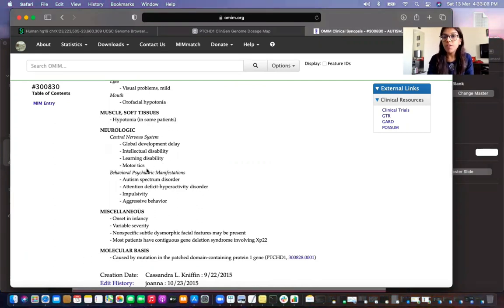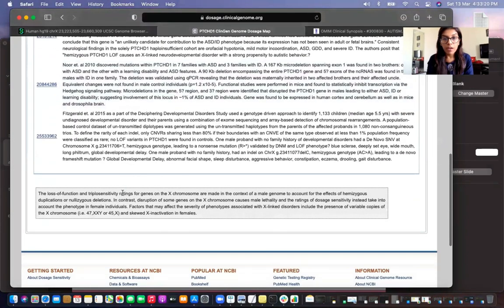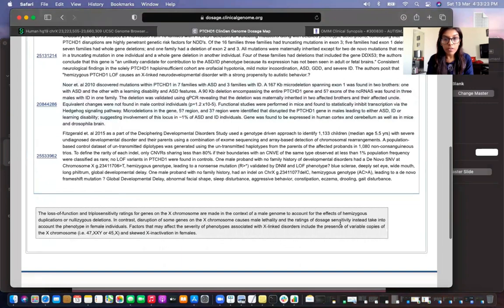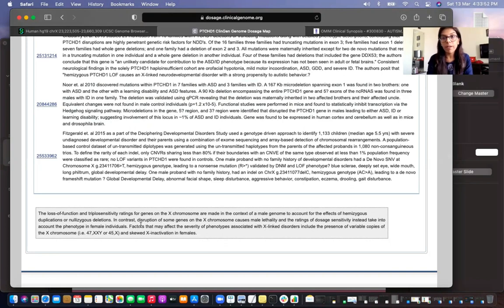The referral example we are studying consists of much more clinical phenotype than just the neurological phenotypes. An important note on the ClinGen dosage sensitivity page is that loss of function and triplosensitivity ratings for genes on the X chromosome are made in context of a male genome to account for the effects of hemizygous or nullizygous deletions, with female phenotype only considered when male lethality may be present.